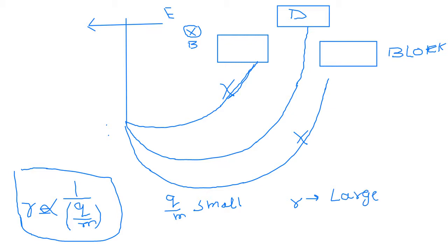This is the radius of curvature, the R value, in this case. The R value for this curve will be like this. In this case, you would have a smaller value of R that will keep on decreasing. You would have a center; this is a larger value of R, and this is a smaller value of R.